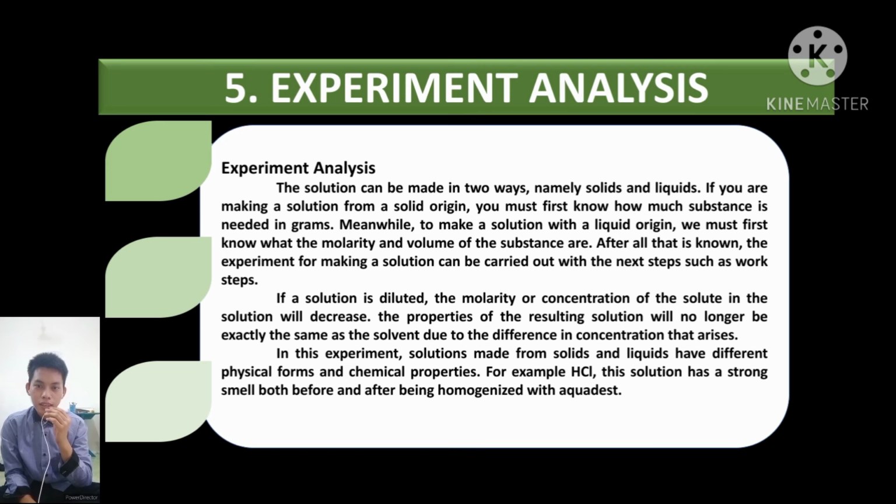Okay, finally, discussion about the experiment analysis. The solution can be made in two ways, namely from solid and liquid. If you are making a solution from a solid origin, you must first know how much substance is needed in grams.